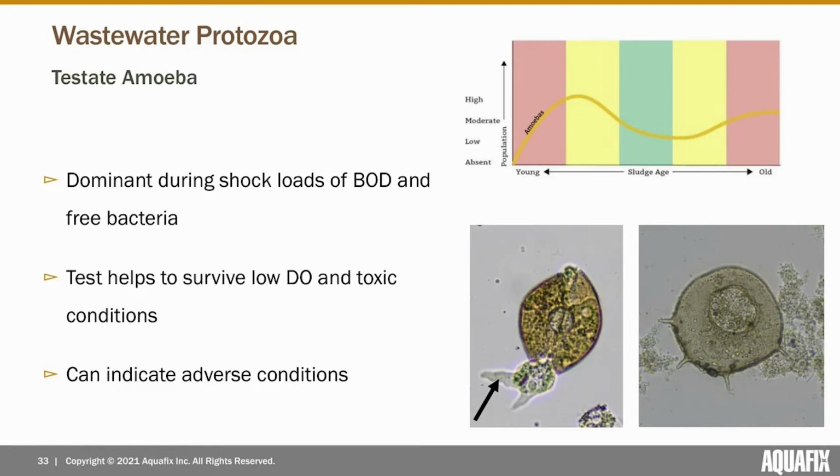However, when you see them, it's important to keep in mind other factors, such as in the first photo with the rotifer. Rotifers, if they're present and alive, are not going to be in toxic systems. So therefore, we can infer that it's a healthy system and it's possible the system was just recovering. As you can see in the photo on the left, there is actually the pseudopodia coming out, and it's starting to move out of its test to rejoin the healthy bacteria because it does not need that test anymore.